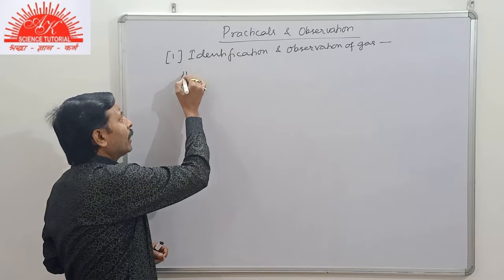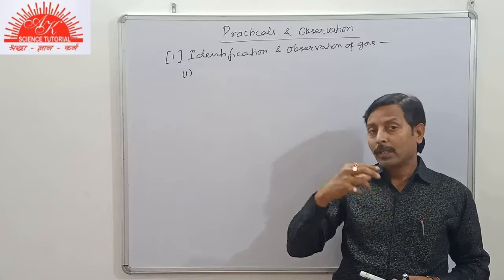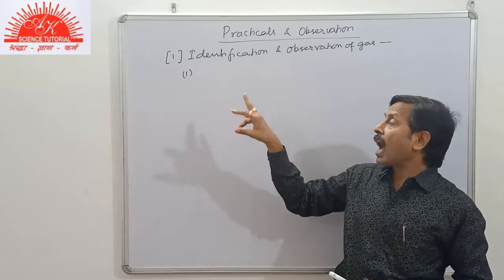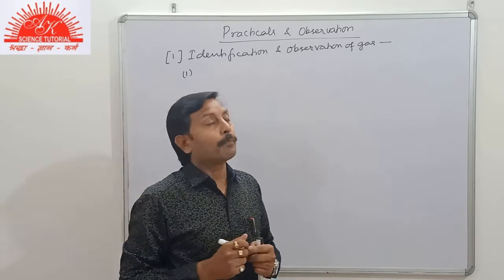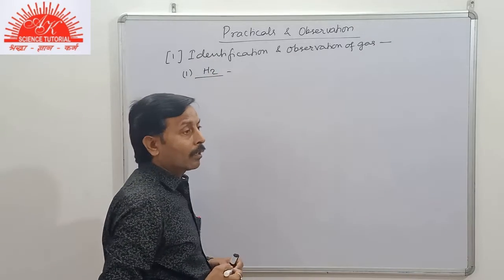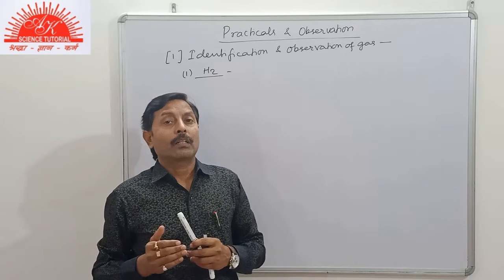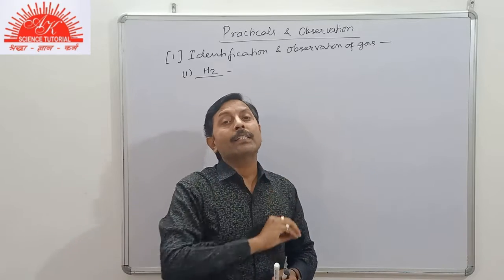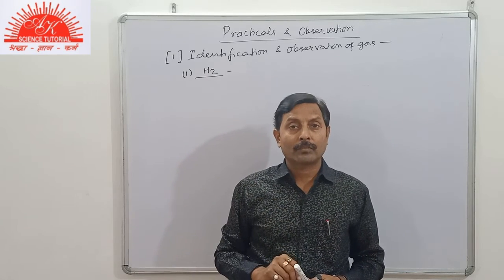Now we will study different types of gases along with some producing equations and observation that will give you an idea of that particular gas. Like, suppose starting with hydrogen. How will the question be asked? Now suppose in the question it will be given that granulated zinc is added to dilute sulfuric acid.